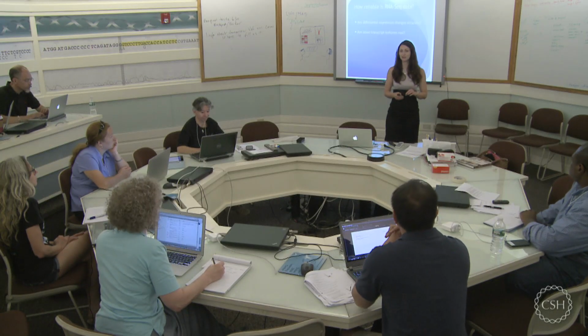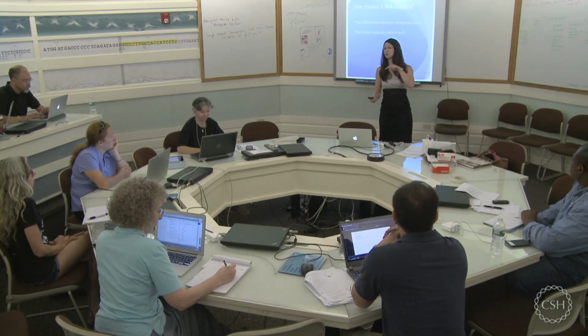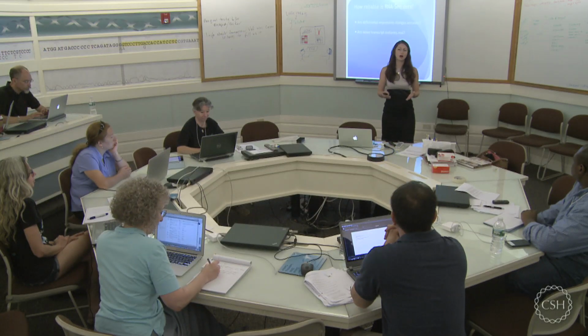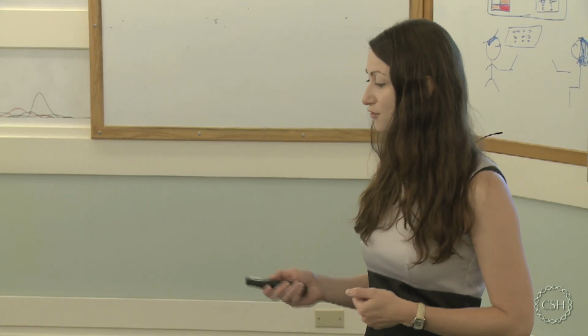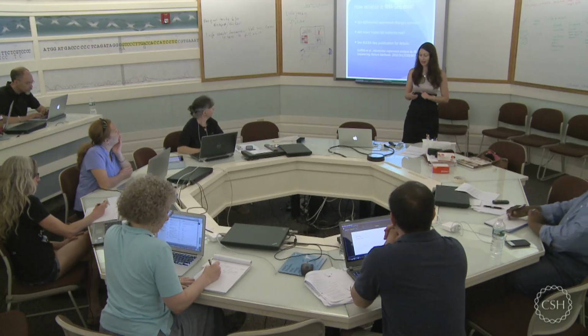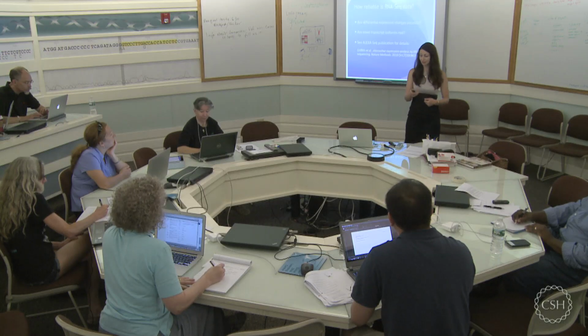However, I will focus specifically on qPCR because, again, when I'm giving my talks, usually people are like, but have you done qPCR on these genes? Have you verified those? And this is probably the commonly used method, and that's why we will focus on that today. But I'm happy to answer any other questions as well, of course. There's a pretty good paper which I would like to mention, although it's already 4 years old. But they have done a very extensive study of comparing RNA-Seq data to microarray data, to qPCR, to Sanger sequencing, to everything you could think of, and have verified how well these methods correlate. So it's a pretty good starting point if you're interested in anything else but qPCR.